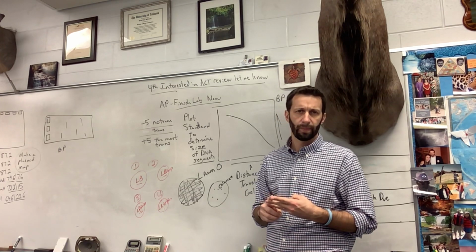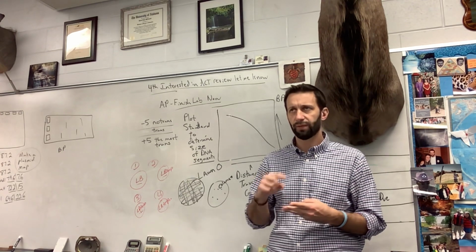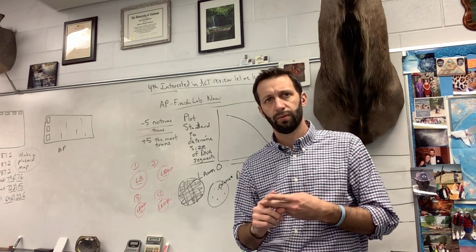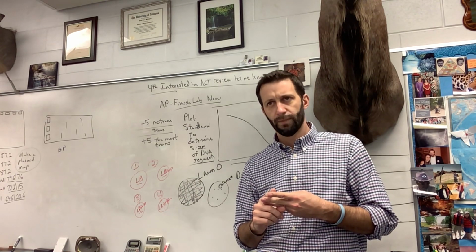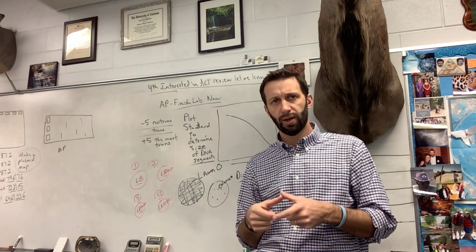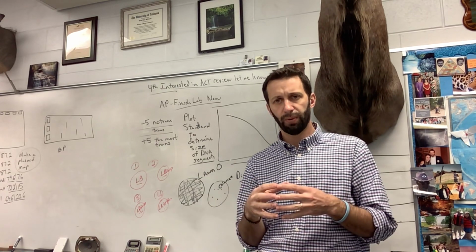Why colonies, Katie? Because I mean, they can grow in it because they are resistant. What's it going to take for them to grow in it? What had to happen? Mason? Then they're taking the Pglo to become immune to the antibiotics. So the original starter plate that you grew bacteria on the first day, you took those bacteria and exposed them to the plasmid.